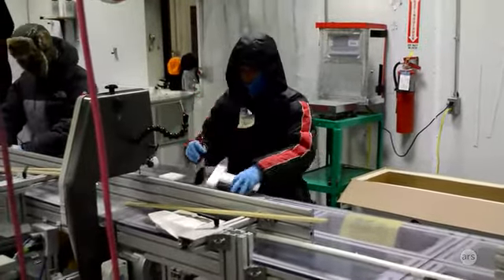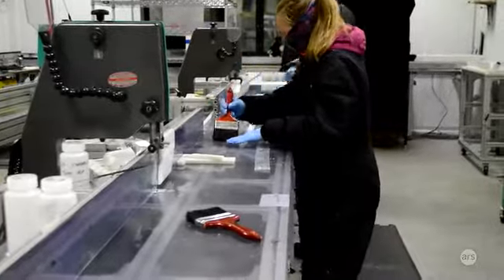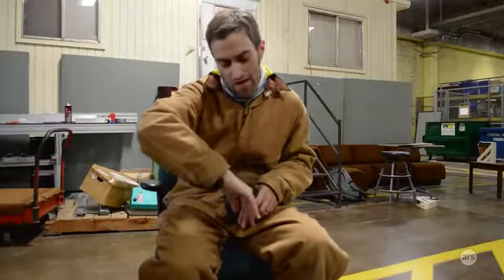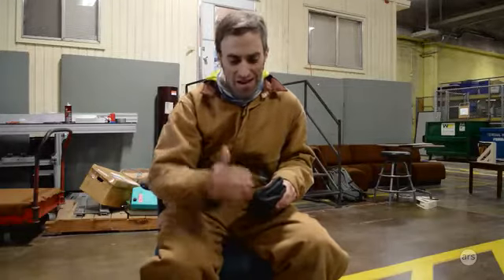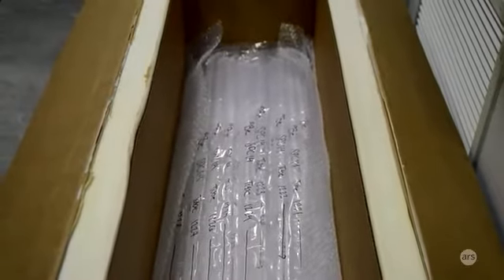Here, the ice is really interesting because it's flowing from upstream. Normally, you see these layers and they're very, very horizontal across the core, I guess vertical when you're looking at it. But now you're starting to see them tilted a little bit or kinked over. It's really cool. So you can get an idea of how much the ice is shearing at that depth.